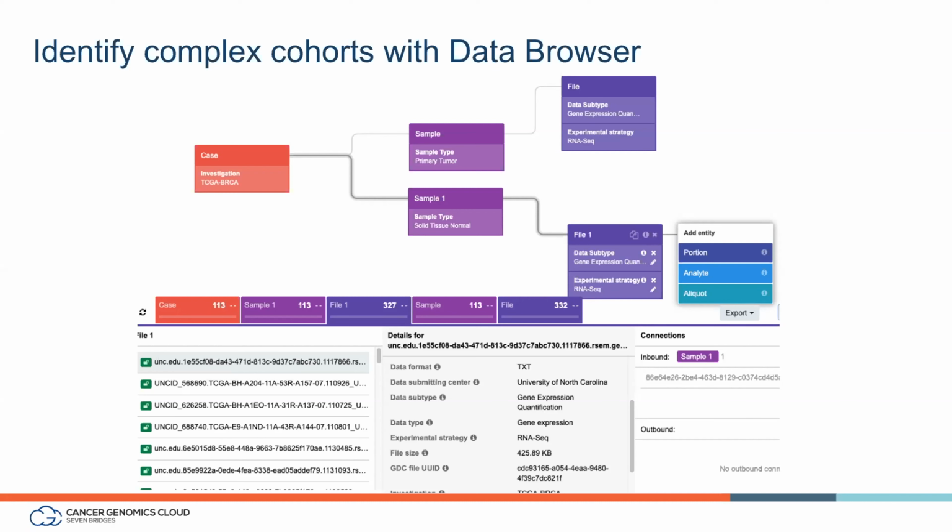And basically any aspect of the metadata that we have on the platform, you can filter down to different groups in that way, and then easily copy all of this data into your project. So it's a very popular way that our users come in to build cohorts on our platform. And you'll get a lot more information about this tomorrow when we go through the demo, as well as in the backend section that's coming up next.